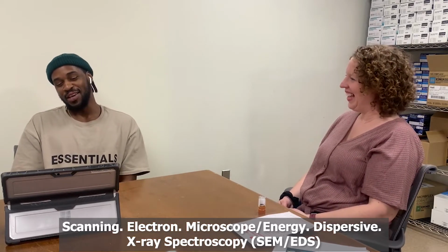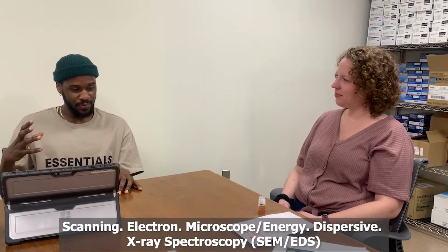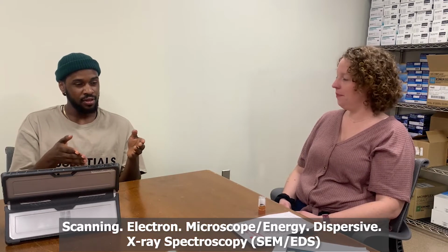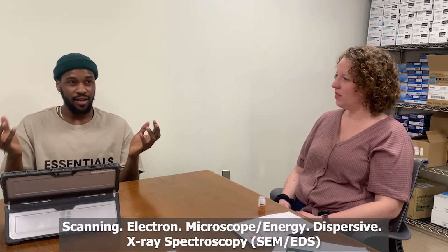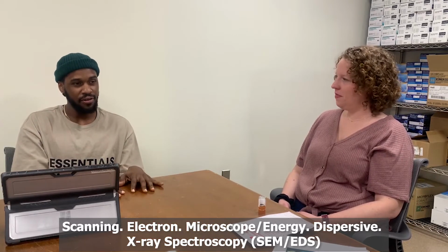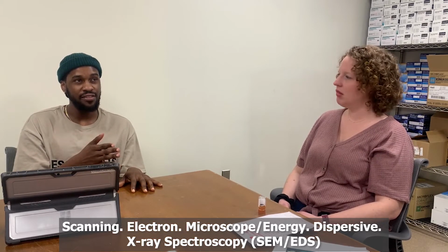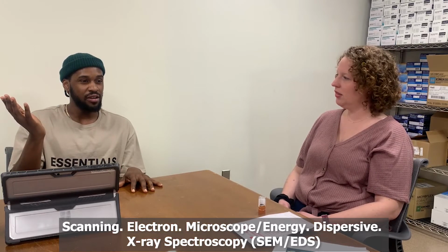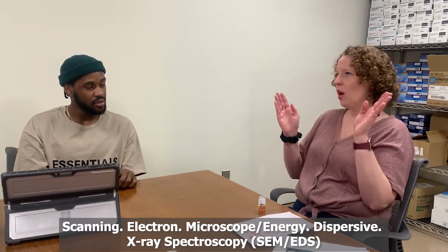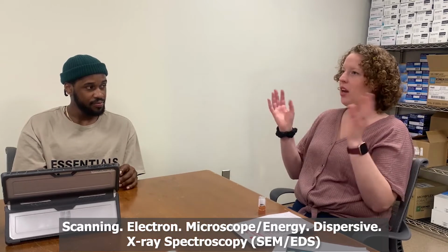Okay, so let me make sure I got all that down. The scanning electron microscope is like shooting electrons at the sample. And those electrons are, for lack of a better word, sticking to the particles, all the different types of particles, and as it interacts with those particles, it gives off some type of energy, which is in the form of an X-ray. So some of the energy that's coming off is electrons, which is how we get the image. And then some of the energy is coming off as X-rays.